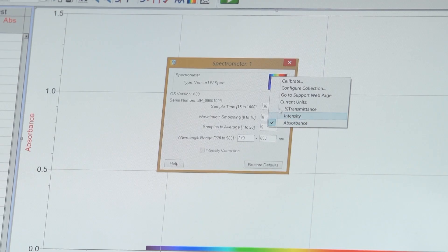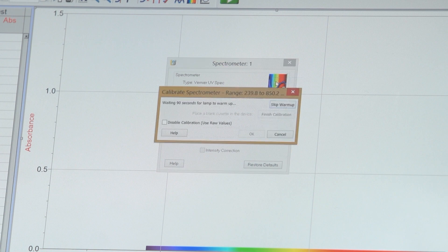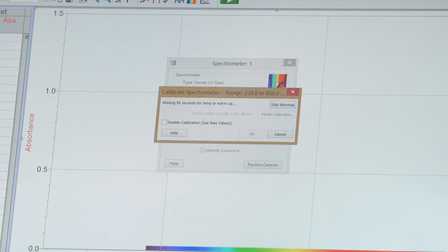For today's demonstration, I'm going to be using absorbance mode, so I'll leave it there. The first thing you want to do in absorbance mode or percent transmittance mode is calibrate the spectrometer. That option is also available in the menu we're currently in. So if I tap on Calibrate, it brings up a separate dialog box for calibration. It requires you wait a minimum of 90 seconds before calibrating. We recommend you wait about 10 minutes. It's also good practice to calibrate right before you take data. It allows the lamp to warm up as long as possible and stabilize as much as possible.